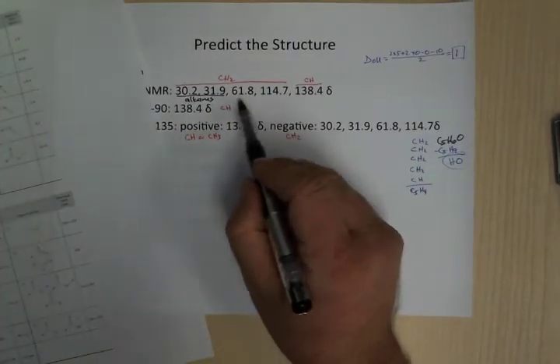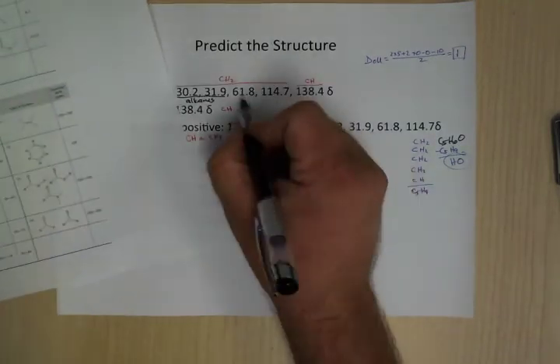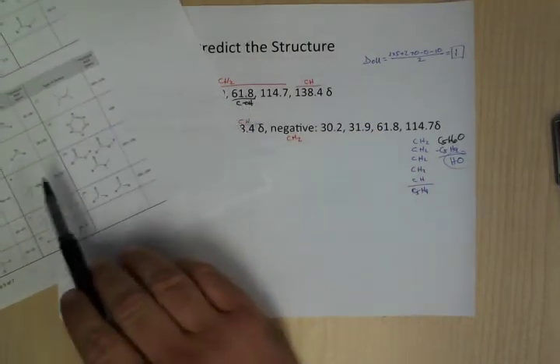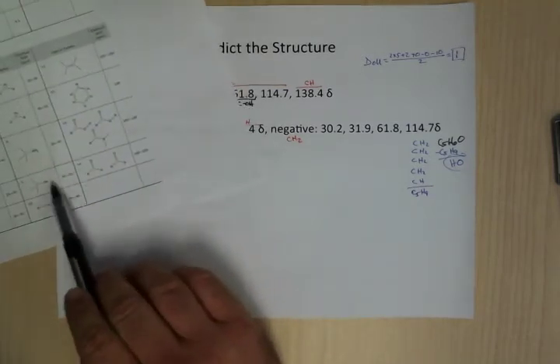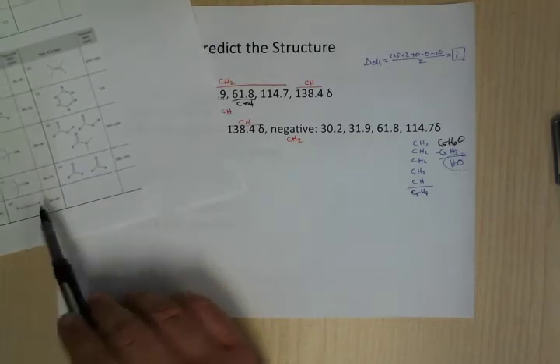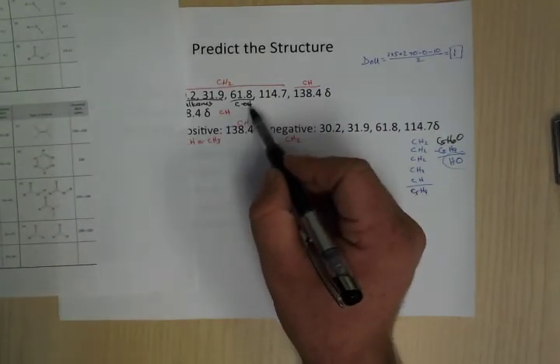This one here, the 60, is pretty high, and it falls right into the range of a carbon with something like an alcohol on it. So we still have that OH with a carbon. It could be pretty close to the triple bond, but we only have one DOU, so it's most likely the carbon with the alcohol on it.